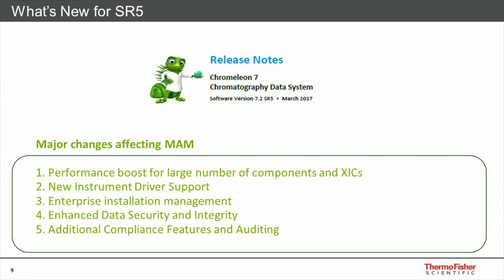So for instance, as compared to a third-party, vendor-neutral software, Chromeleon can actually run the Q Exactive. If you don't take anything else out of this talk, that's it. Chromeleon can actually do GMP acquisition on an Exactive series instrument. Because it can do this, it can maintain a data vault, and it will run an integrity check to make sure that nobody has adulterated the data.